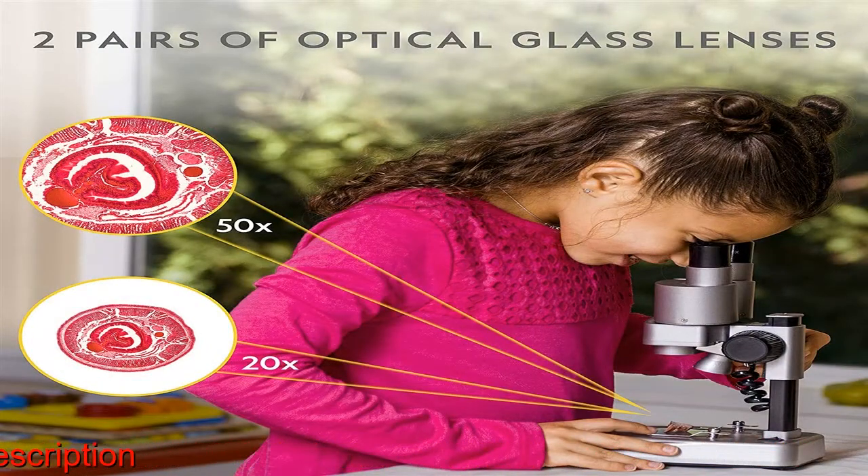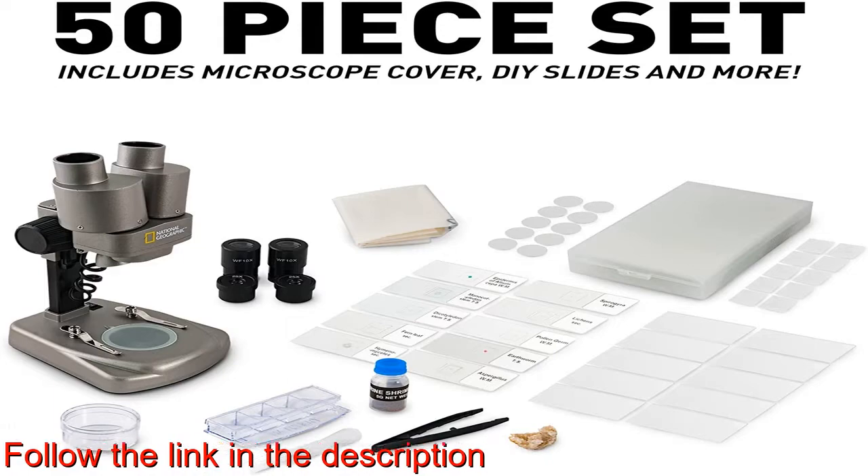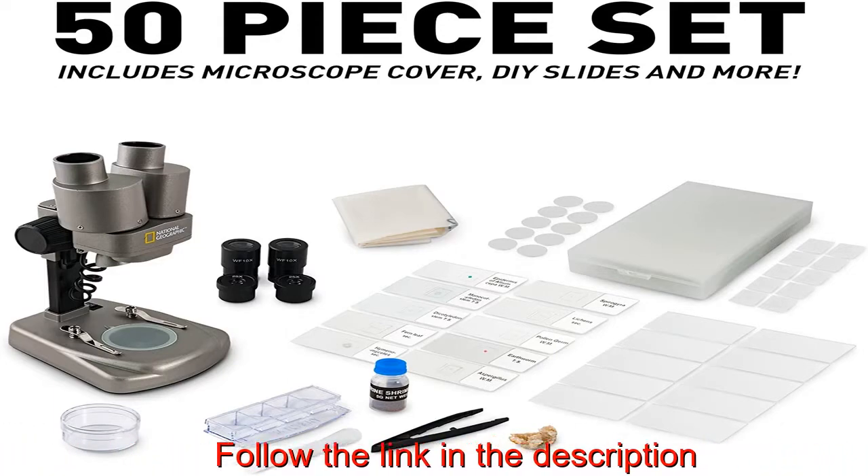This complete kit also includes a petri dish for plant labs, a mini geode, and more. This microscope features two sets of optical glass lenses providing 20x and 50x magnification and is easy to operate, making learning fun and accessible for young scientists.